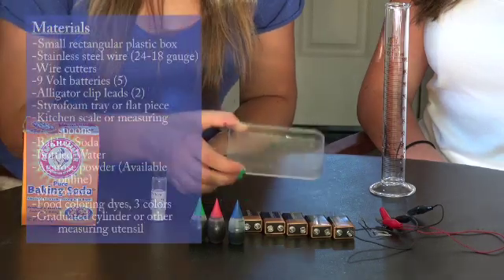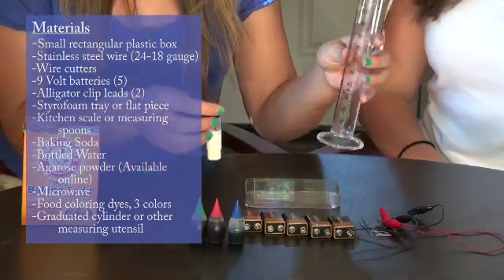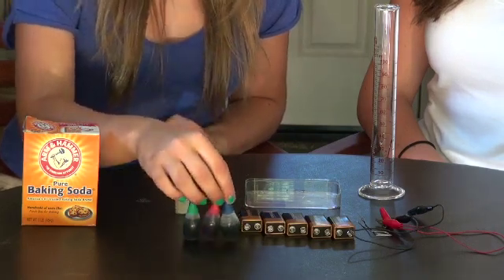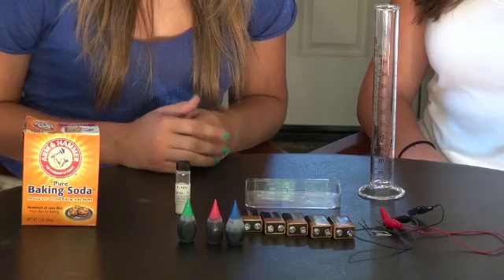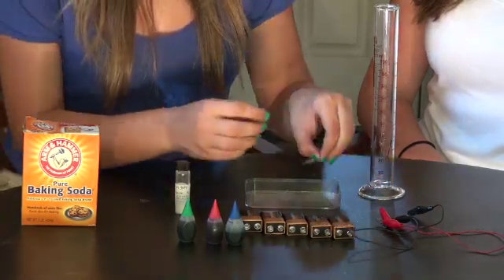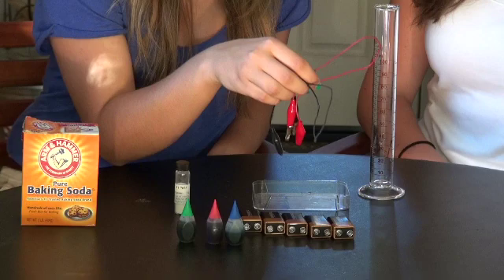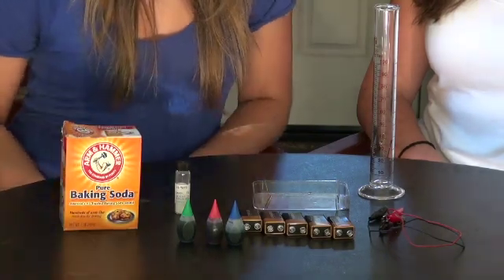To make our gel, we'll need a small rectangular plastic box. We'll also need agarose powder combined with water measured in a graduated cylinder. Instead of DNA, our samples to be put in the gel will be food coloring. Make sure to have at least two primary colors and a secondary color, like green, orange, or purple, to be separated with electricity. Our power source will be five 9-volt batteries. The power will be added to the rectangular box in the form of two electrodes placed at either end, made out of stainless steel wire. We'll also need alligator clips with leads to connect our batteries to the electrodes. And finally, we'll need some baking soda to be mixed with water in a buffer solution to run our gel.